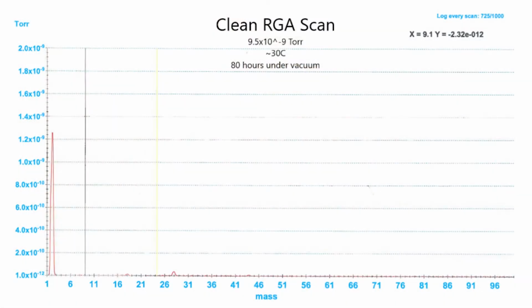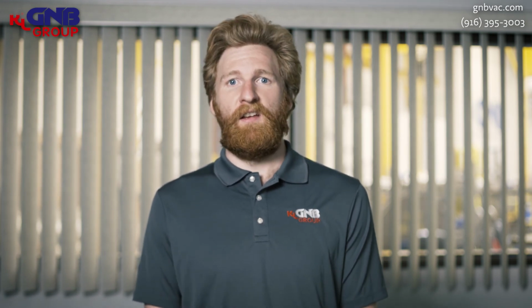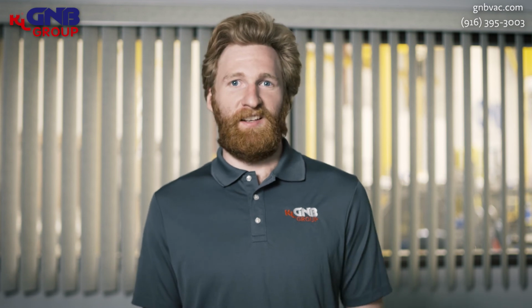And speaking of which, this is what a clean RGA scan looks like. You can see, if you look at the partial pressures on your y-axis, they're much lower, and there's only a couple peaks left. Like I said, you've still got some of that hydrogen in there, maybe a little bit of water, but for the most part, you don't see any of those contaminants from hydrocarbons, and you don't even see all of the typical atmospheric gases that are going to be present just from being in air.